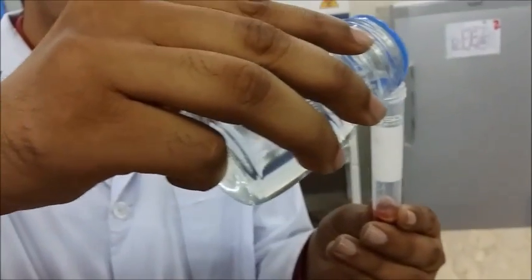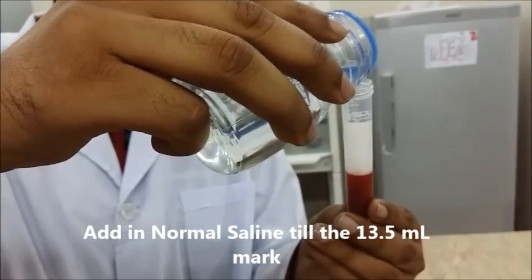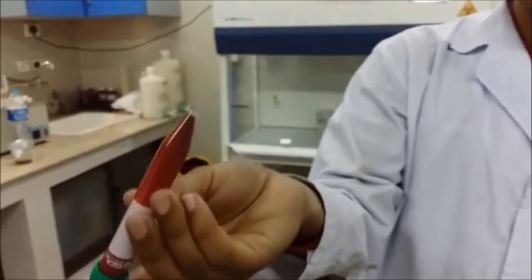Now we are going to add normal saline solution and make it up to 13.5 ml. Then gently shake the whole thing — not too roughly.